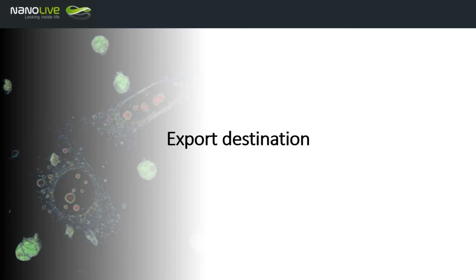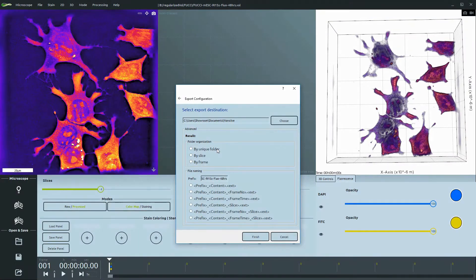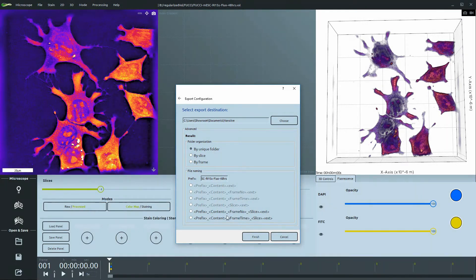The final step is to choose a destination. There are advanced options to organize your data in an efficient manner. For folder organization, you can choose if you would like a unique folder, or if data should be stored in individual folders per slice or per frame.